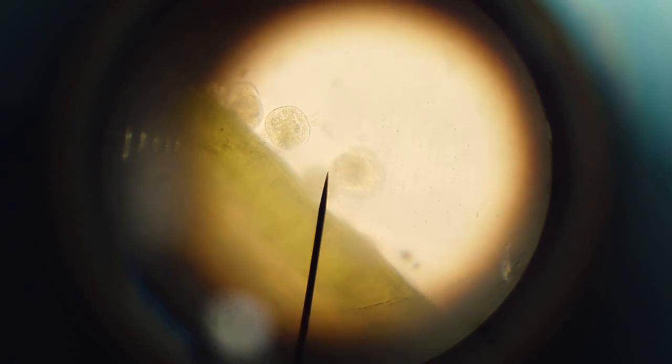These right here, just up and to the left of the needle. This is at 400 power, 400 magnification. And that's all we got.